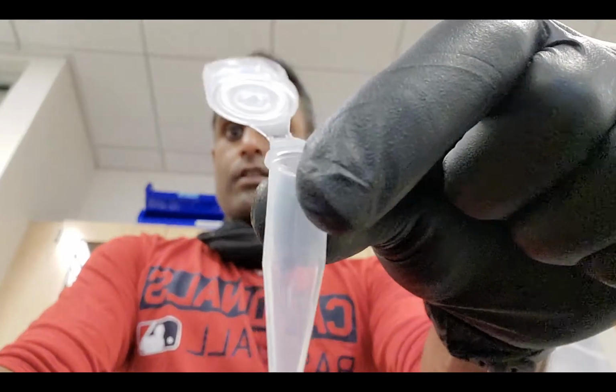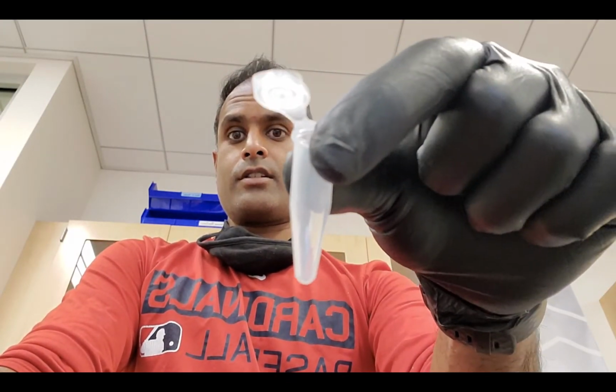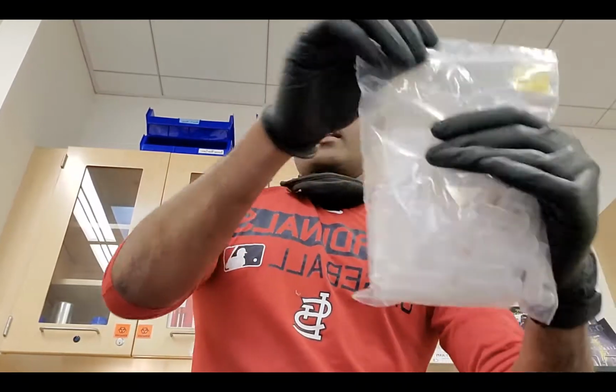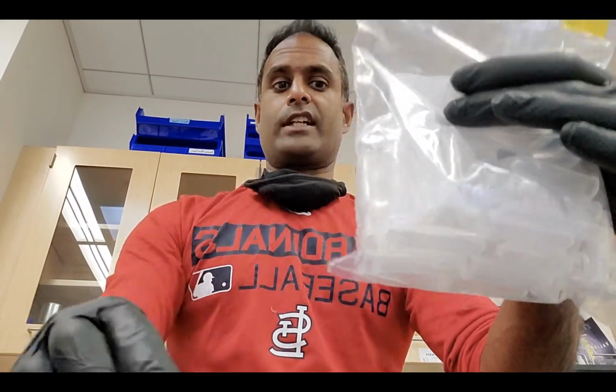So in order to set up, I'm going to need a few things. I'm going to need this, which is a 1.5 mil centrifuge tube, which looks a lot like another type of tube that I'm going to show you. So this is a collection tube, and you'll see the difference here in a second.